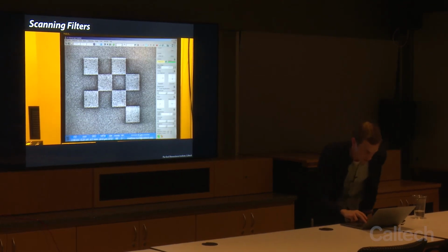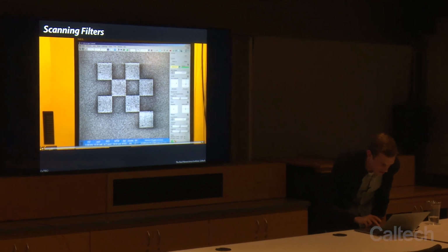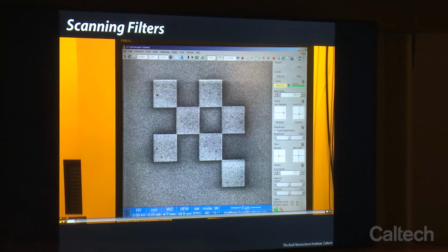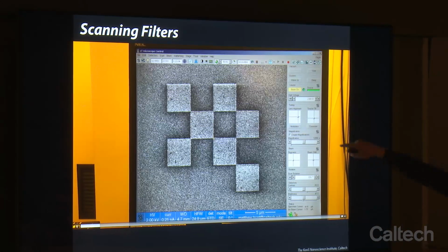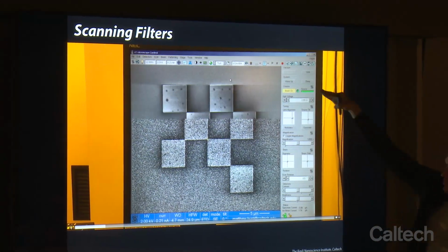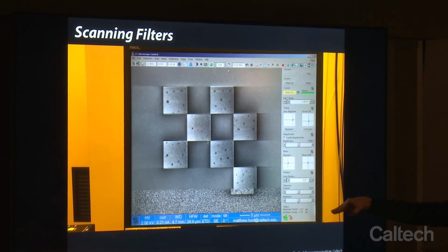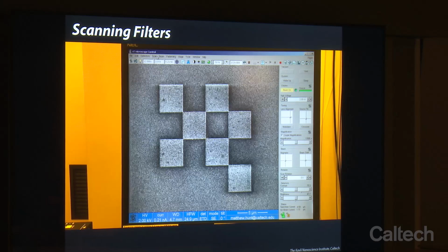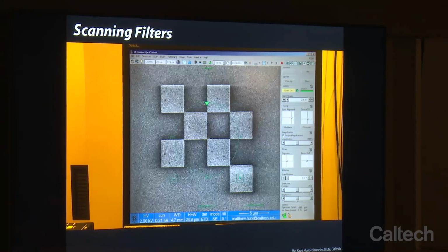This is a video that demonstrates this. So there's no artifacts here, but if I have a longer dwell time, so it's a longer frame time, because each pixel is dwelling longer, we get these sort of horizontal artifacts.